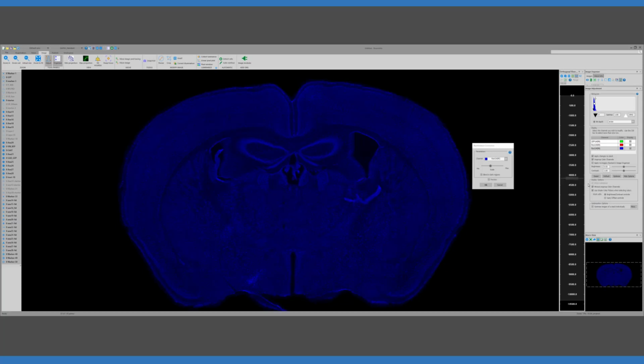The other is to use Page Up and Page Down, but in this case, Page Up and Page Down actually adjusts the scale slider rather than moving from one section to the other. Is that correct, Brian? Yeah, that's right. And you might want to just turn on preview again, and then you can go through this.